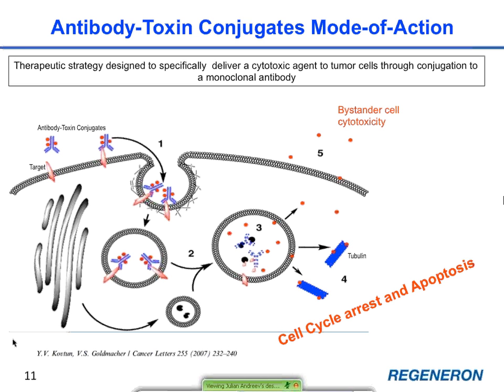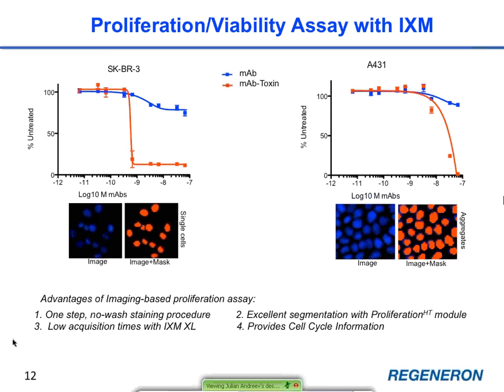This is the theory. But let's look a little bit into how this approach is being applied in practice, and which assays, especially imaging assays, we can use to measure the effects of ADC in vitro. One assay, which is probably the most in demand for ADC programs, is your everyday proliferation assay. Assays for cell ATP and metabolic activity are the predominant tool in this area. They are cheap, fast, and robust. However, as shown nicely by John Moffat from Genentech at CHI 2012, high content analysis nuclear counting would actually be the method of choice if it were not so time-consuming.